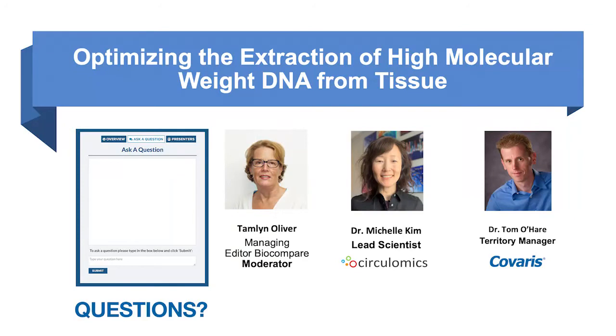Okay, how can I efficiently isolate workable amounts of megaplasmids from bacteria? Is it a low copy number plasmid? We do have a process for isolating plasmid from bacteria, and for that process, we were using bacteria that had high copy number and mid-copy number plasmids that were about 8 to 12 kb. We haven't tried bacteria that are carrying megaplasmids though, but I can get back to you with some more information on that later.